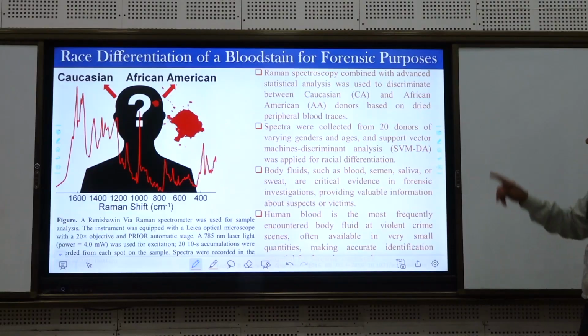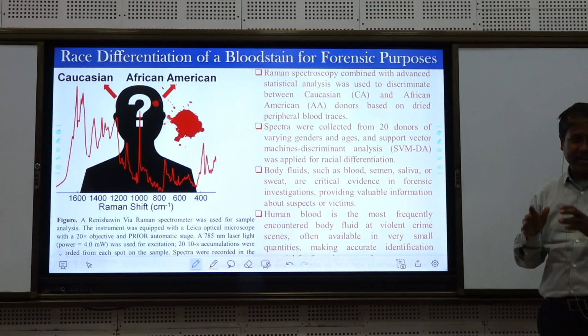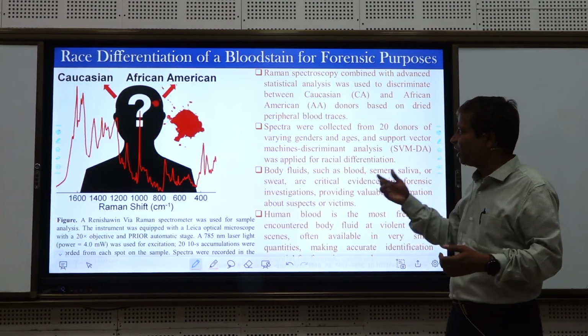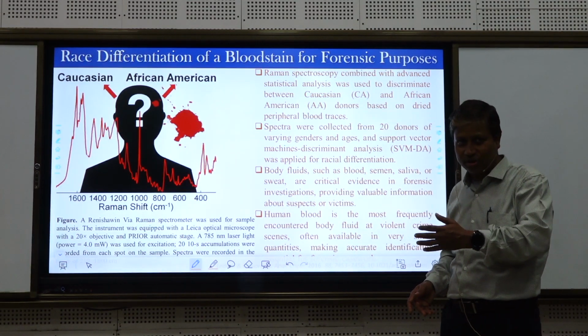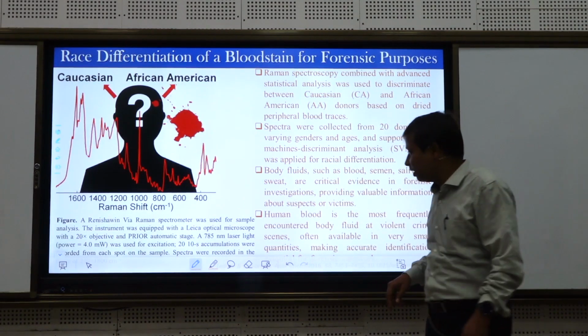This is another thing, whether mainly in America, Caucasian and African American, whether your Caucasian is an old generation, they can be distinguished, whether this race has come from that race or not. So they have said that it is possible.